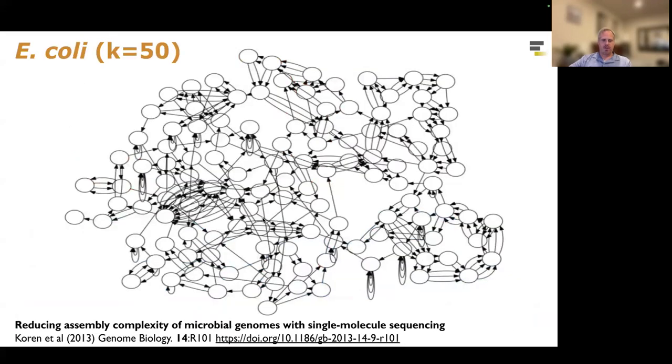So here's a biological example of how this might look. This is taking the E. coli genome. That's about a 5 million base pair bacterial genome. It's a circular genome. And what we're going to do is consider all the 50-character subfragments. When the length is 50, that's called a k-mer. Here the k-mer length would be 50. So this is sometimes called a 50-mer.